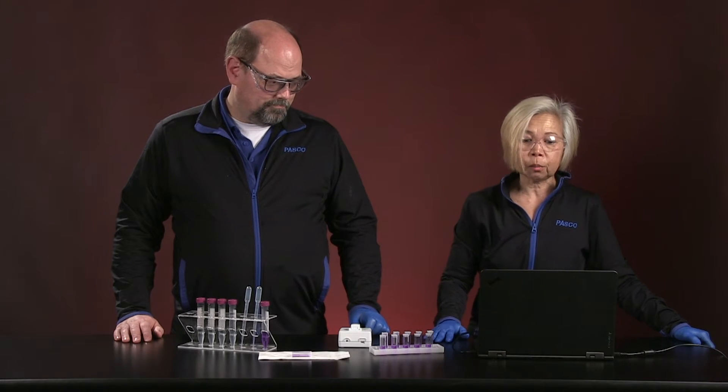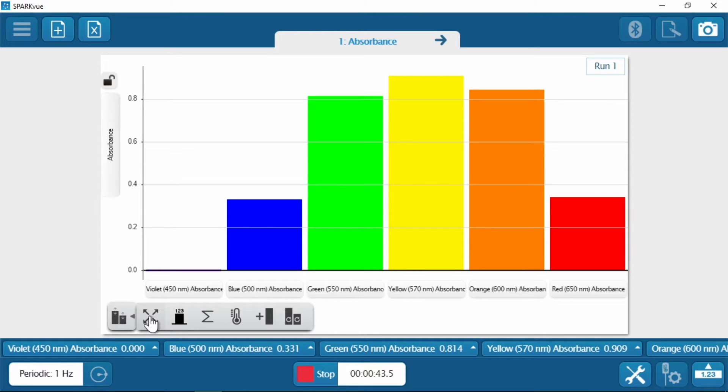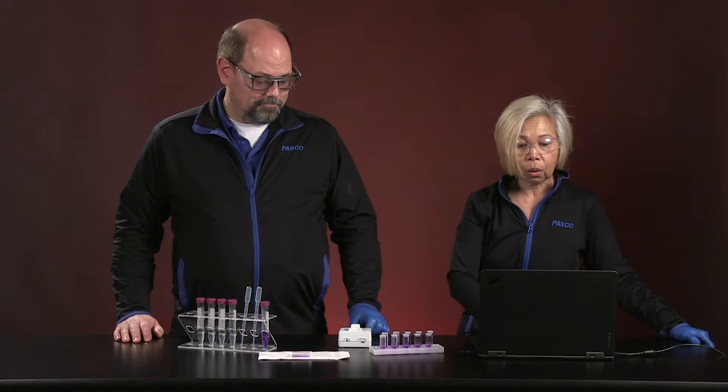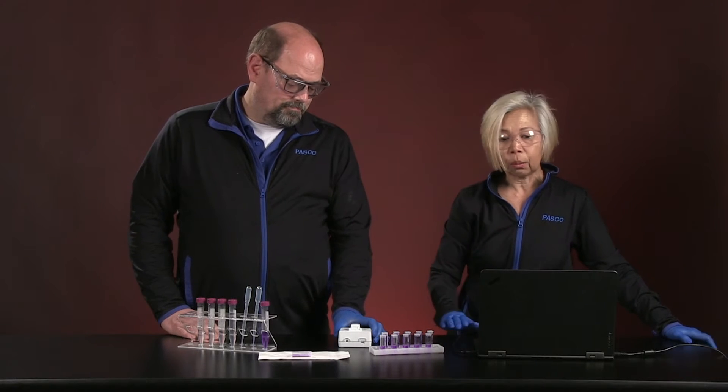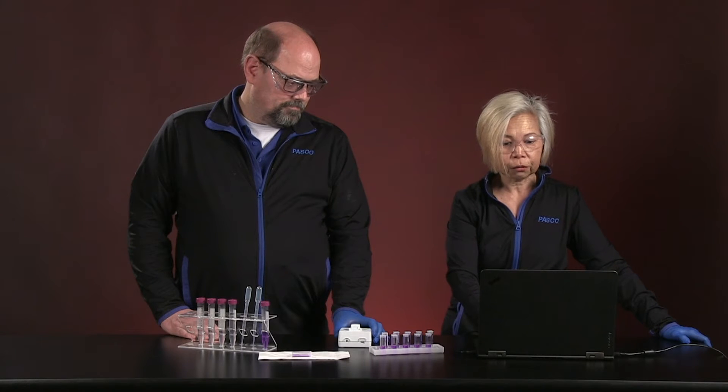But for the purposes of this experiment, now that we know that 570, the yellow wavelength, is the wavelength that we will be needing to do this study, we now are ready to run our first experiment for today.